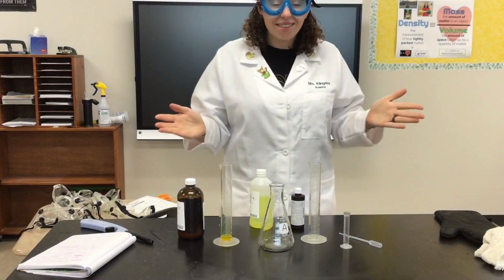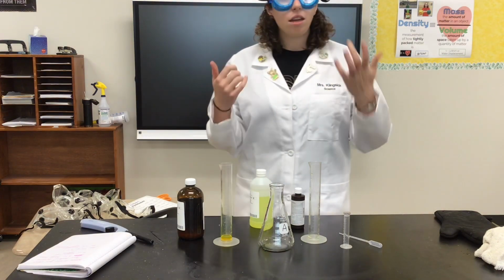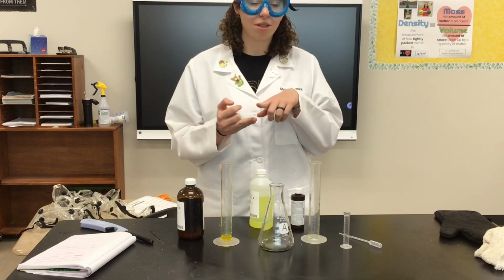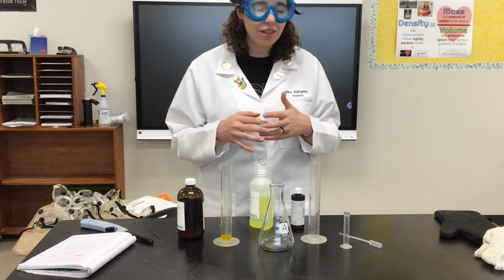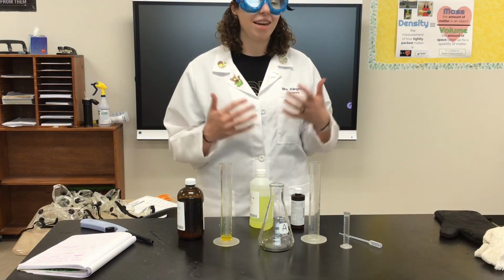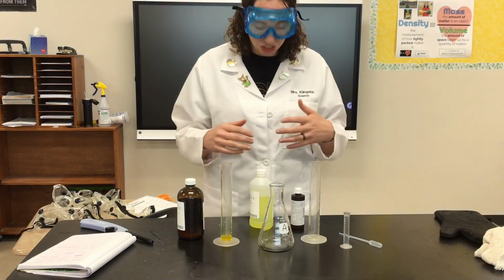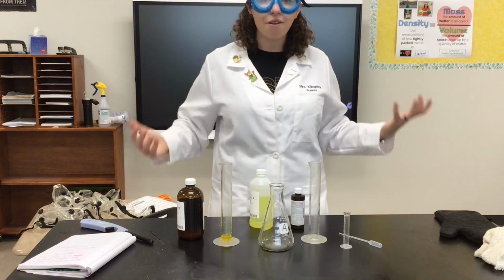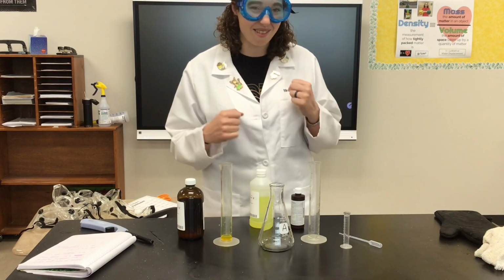All right, so this is the last show of our Chemical Roadshow. So we have seen chemical changes that let out gases, that also let out bubbles, which would be the gas. They had color change. We have had heat or cold, so that's a temperature change. We've seen lots of things that have created a chemical change. So we have one more that I want us to see, which is a light change, where light is given off. This is kind of like a firework. So we're going to actually produce light because of a chemical change.